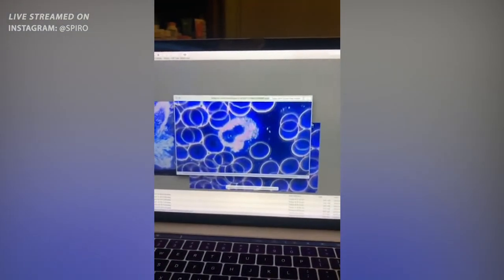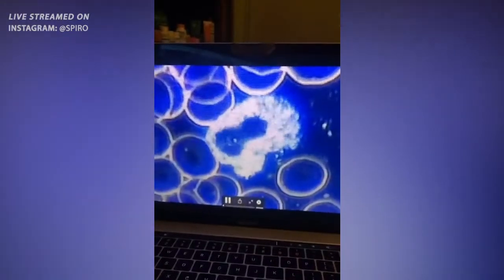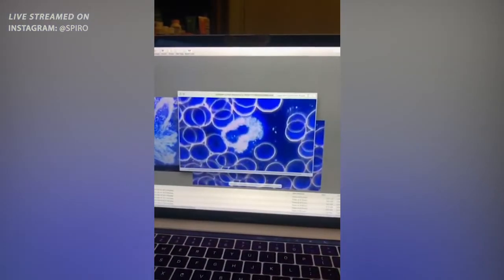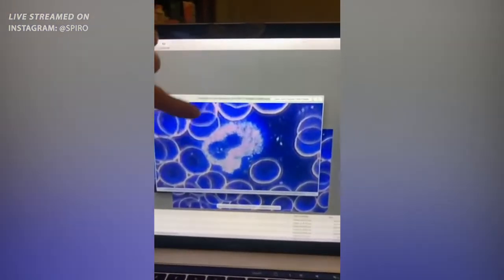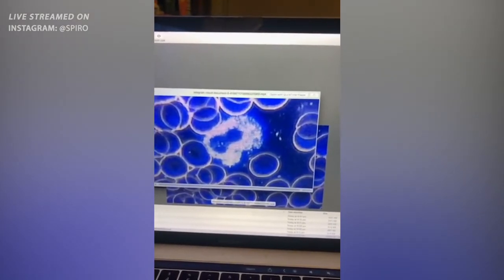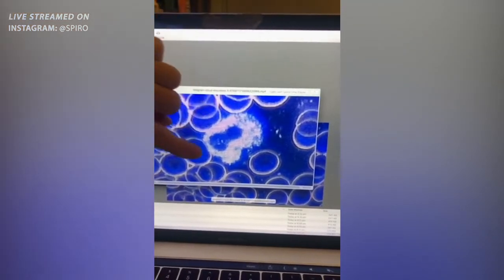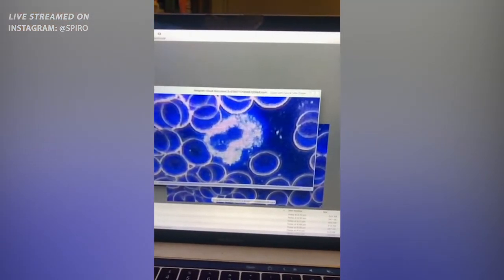So this one is a video. Let's enlarge it. This is actually really difficult to explain, because it's a white blood cell, but also here, very unusual how it comes out. It's not normal to look at this, and these overactive movements in this cell.